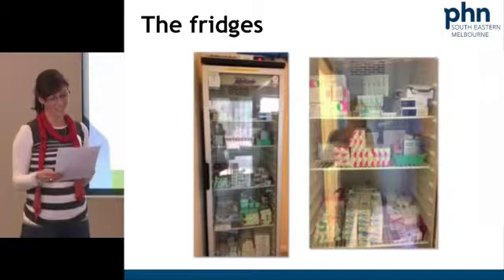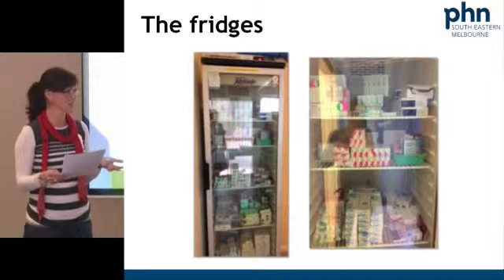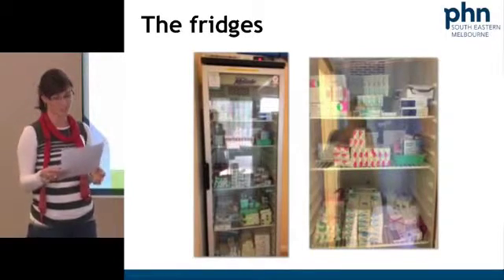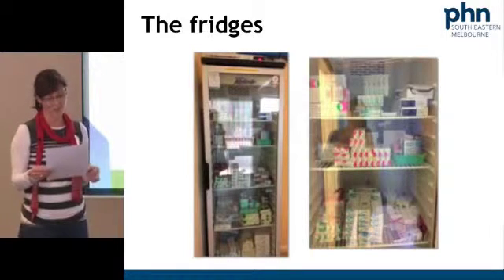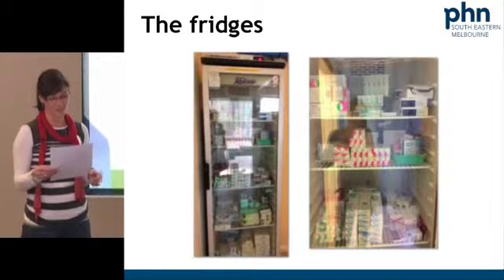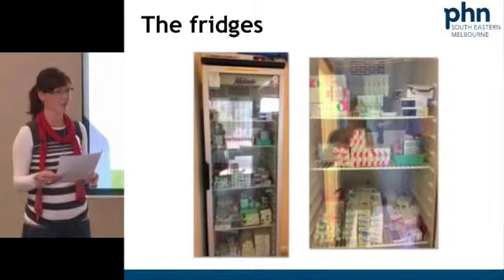It must be noted that we have only had these fridges for 3 years, so they're not very old at all, and we haven't had a lot of maintenance done on them, so they've been working effectively for us for the last 3 years. The gentleman who came out to attend the service did the service last year for us at Bluff Road, and he was satisfied with the running of them, and all he did was adjust the calibration on the controller last year to make sure that our fridges were working effectively and met the standards of compliance.